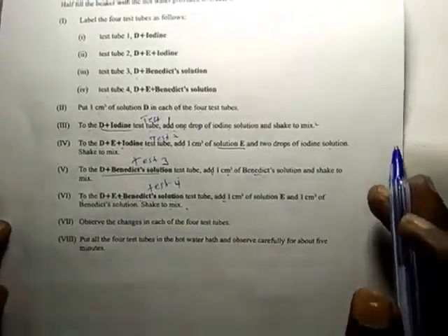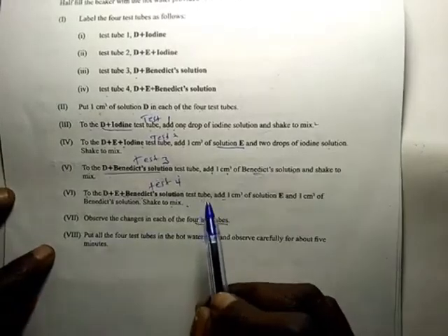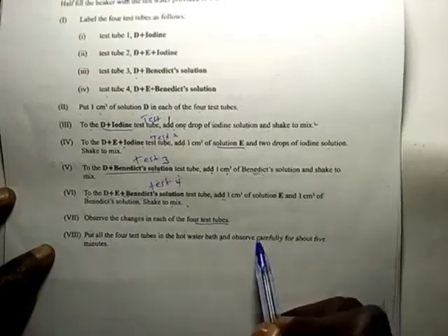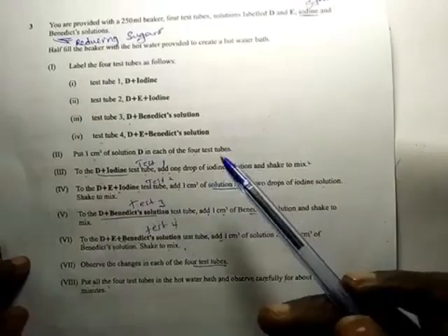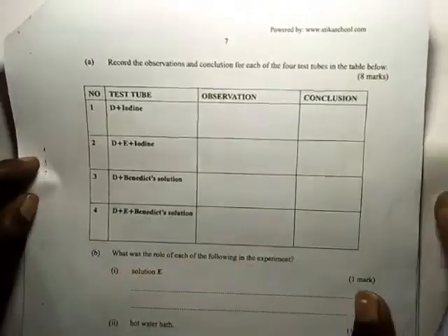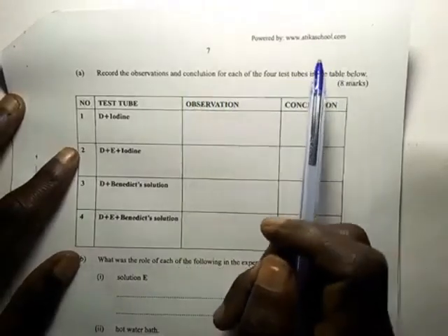Now after you have done all that, observe the changes in each of the 4 test tubes. After you have observed each, put all the 4 test tubes in a hot water bath and observe carefully for about 5 minutes. In practical, even in chemistry, just follow the procedure and you will understand. Let's go to the questions. Now here we are lucky because we are not told to write the procedure. We are only told to write the observation and conclusion.